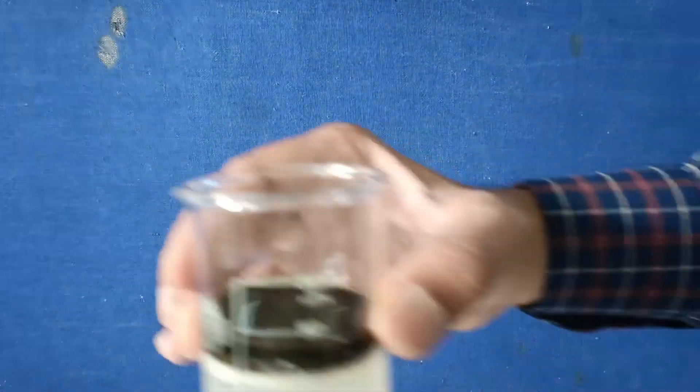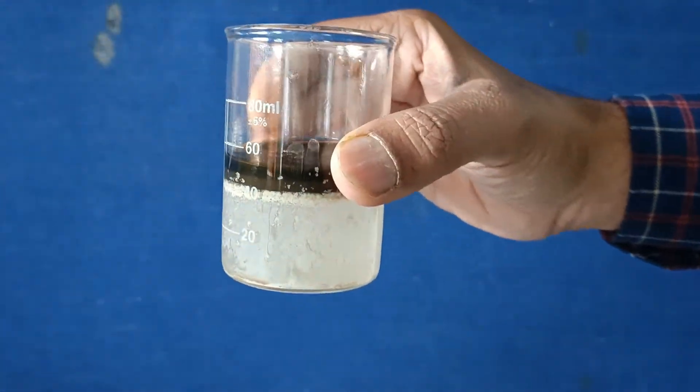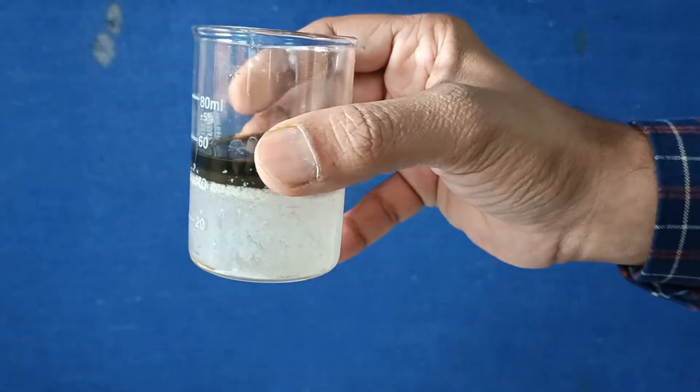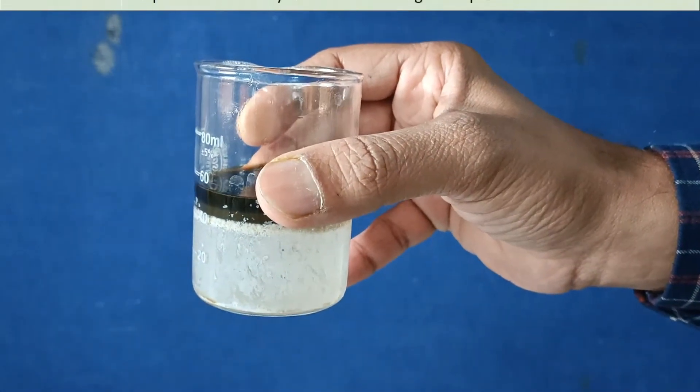A mixture of oil and water. How to separate them? You can see very well that oil floats on water. This is because the density of oil is less than the density of water.